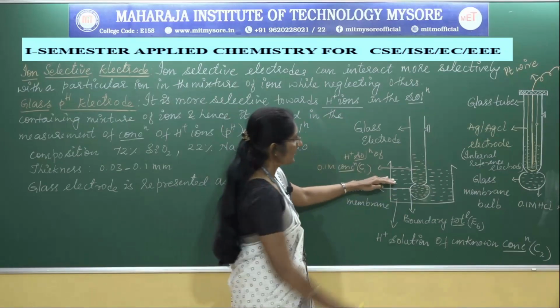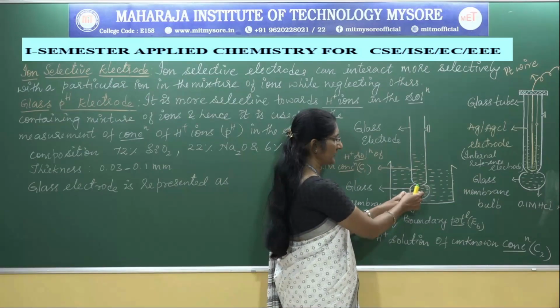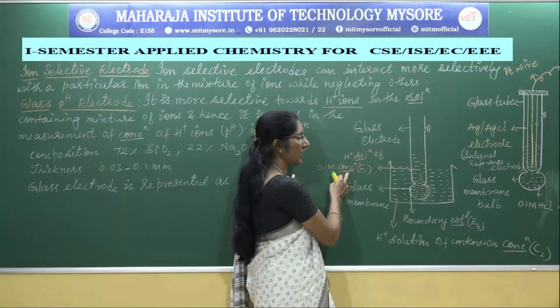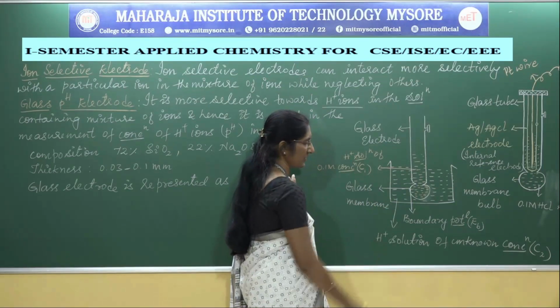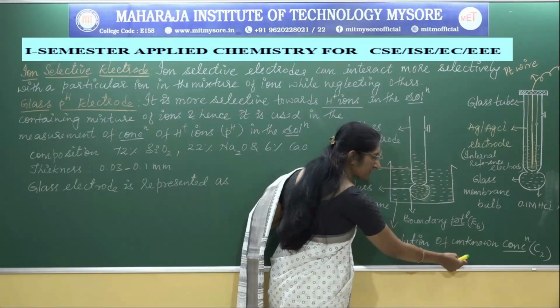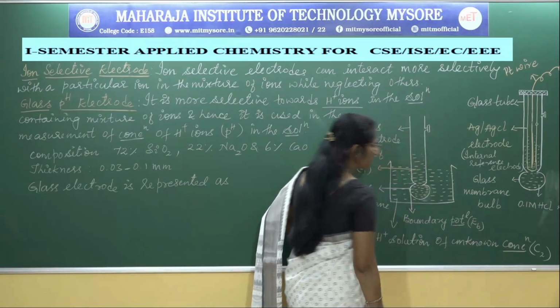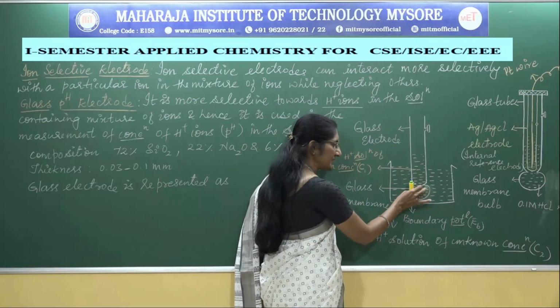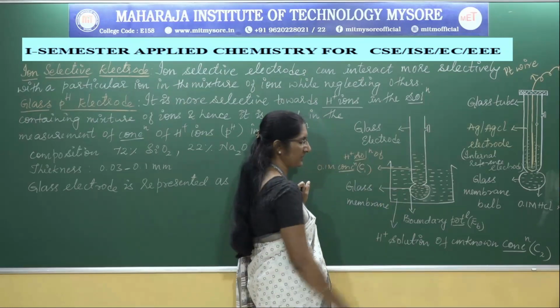Observe the concentration of the inside solution. It is a H plus ion solution of 0.1 molar concentration. Let us consider this as concentration C1, and the electrode is dipped in a H plus solution of unknown concentration, which we consider as C2. Inside and outside, H plus ions are present.